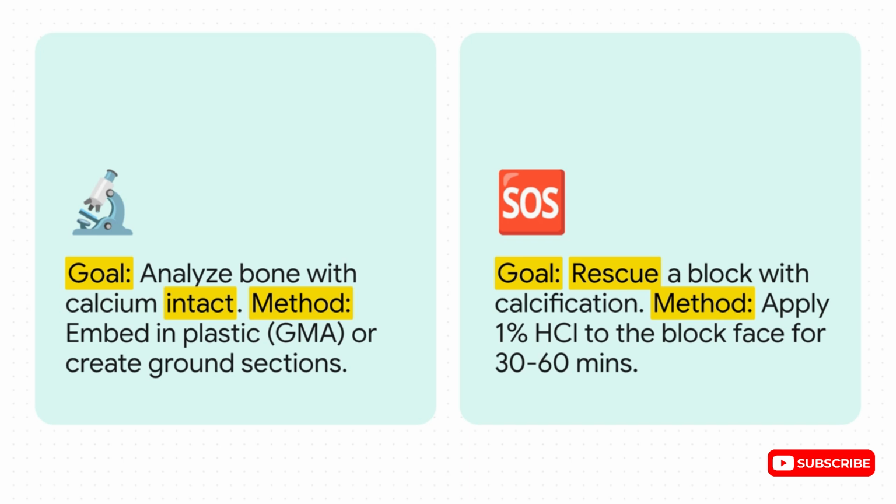And that really brings us full circle. From powerful acids to gentle chelators, from careful planning to last-minute rescues, mastering decalcification is all about knowing which tool to use to deliver the absolute best slide possible.